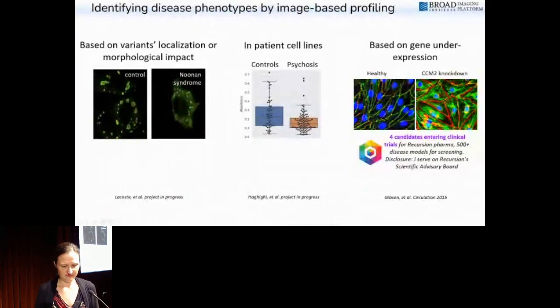Fantastic talk. Can cell painting capture morphological changes independent of what one of the 6 stains probe for? For example, some perturbation causing neurotypes. Would that be the same as your bipolar disorder example? Causing what? Neurotypes. Oh, I see. I think I understand the question. So it is absolutely the case.